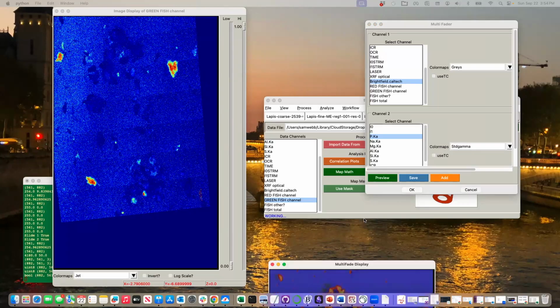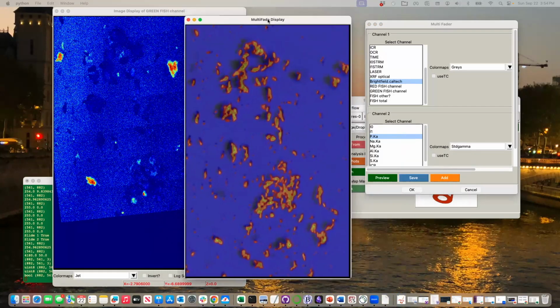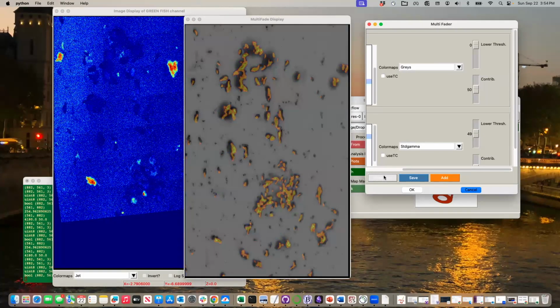And we get a display like this, a little psychedelic. There we go. We see the camera image. I'm going to see if I can make the standard gamma with a lower threshold again, see if this works. There we go. It's bringing down some of that data so it's not all just blue on the background. And now you see the optical image in gray with the high points of the phosphorus now in color. So I've gotten rid of that blue background.